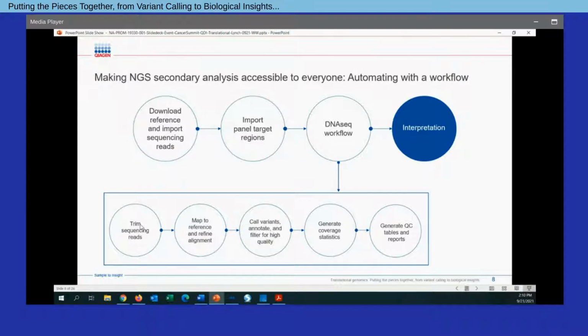In particular, when we talk about targeted sequencing, coverage reports are oftentimes very useful in making sure we have enough sequence to accurately detect variants. And then lastly, exploring the variants themselves. Now, just a quick side note: if we were to be running the same process on somatic samples, there are scenarios where within our workflows, we also have additional capabilities that you might want to employ, such as identifying copy number variants, calculating tumor mutation burden, and also interrogating microsatellite instability status as well.